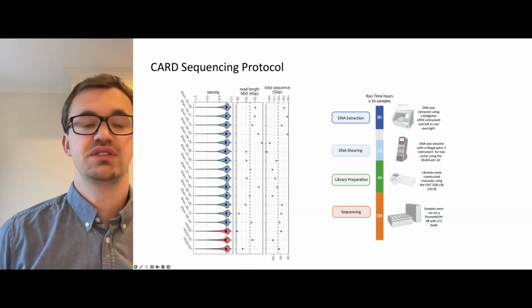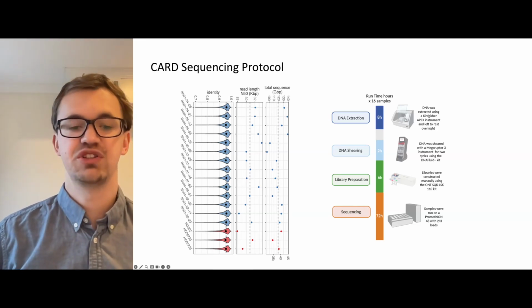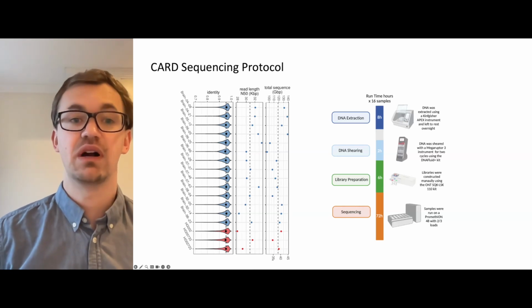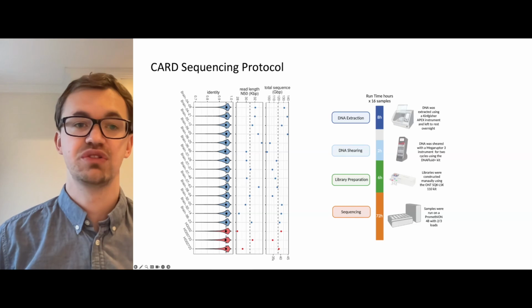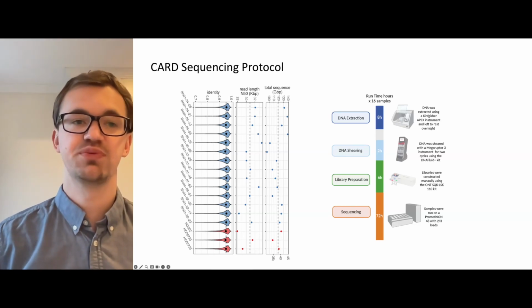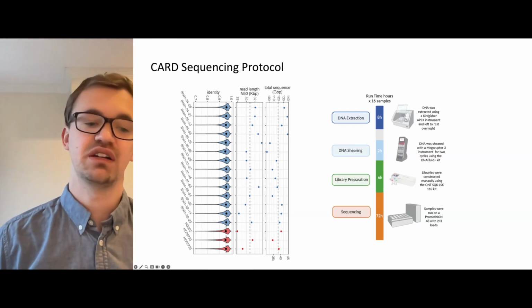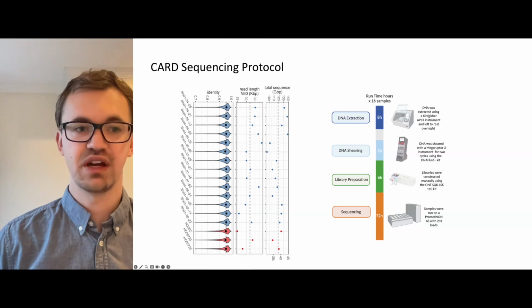So this is certainly not ultra long, but as you can see, this is actually very much sufficient for the analysis of structural variants in most parts of the genome, perhaps excluding the longest segmental duplications and centromeres. So these are the numbers for R9. For R10, we have somewhat similar numbers. It required some tweaks, but I think with the recent updates, we can actually push the yield with R10 up.